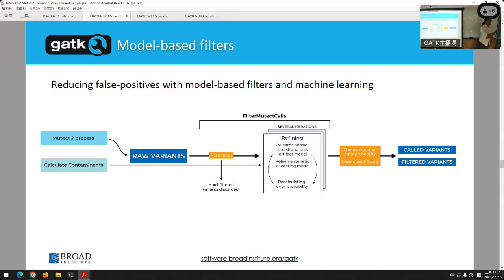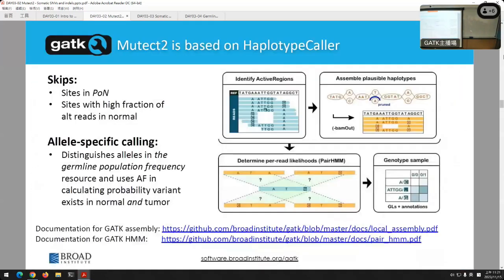All right, another question? So can we use RNA-seq data for actually figuring out the allelic imbalance? Okay, that's interesting. I haven't actually used it that way, but Eric's answer is that it should work with RNA. That's a cool use case. Sure thing. Which one was that, Eric? Here, was it this one? All right.